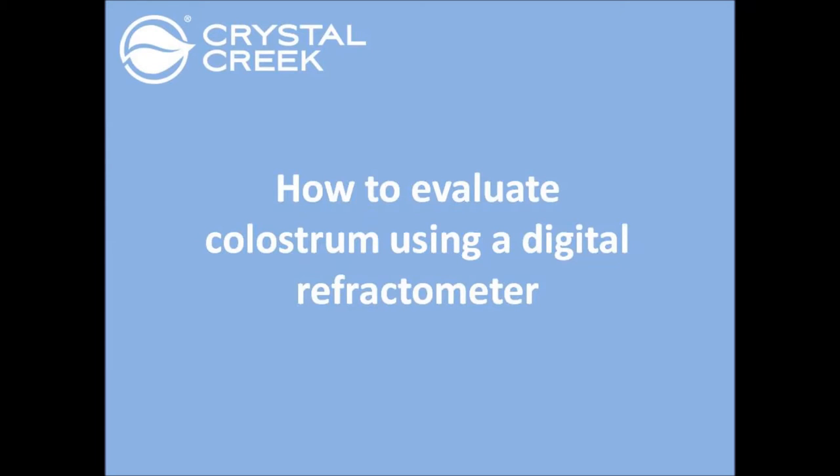This video will show how to evaluate colostrum quality using the MISCO Palm Abbe Digital Refractometer.